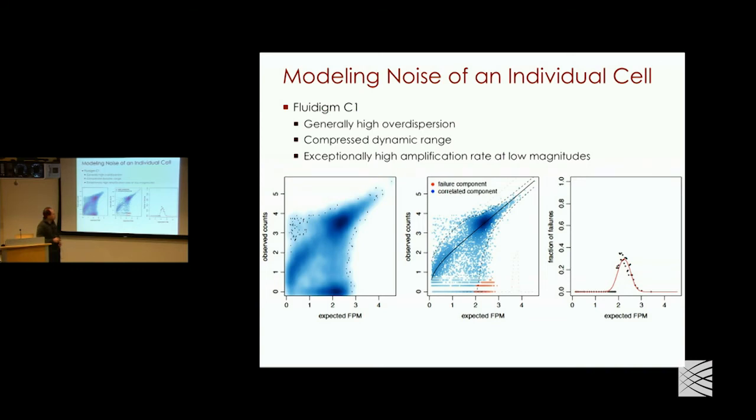And you can't explain this with negative binomial, and I tried a bunch of other distributions. Essentially, they're kind of outliers, but they occur again and again. The other thing you can see is that the genes you do detect, most of them are bunched up in this area. So essentially, the reported magnitude is kind of squashed, right? That means the dynamic range is pretty poor. There's some extra dropouts on top of this negative binomial, but you already see that it's so wide that it accounts for a lot of zeros to begin with.